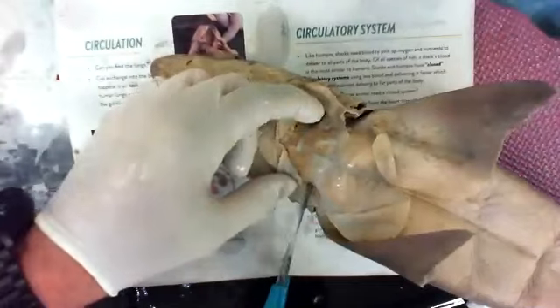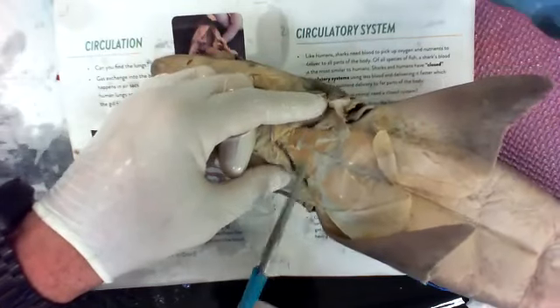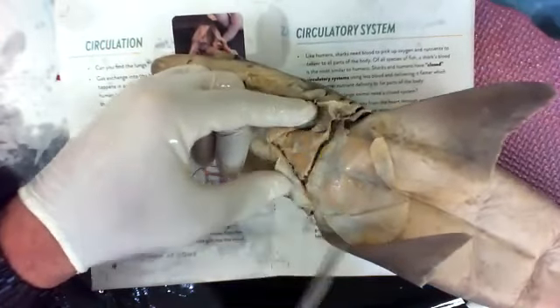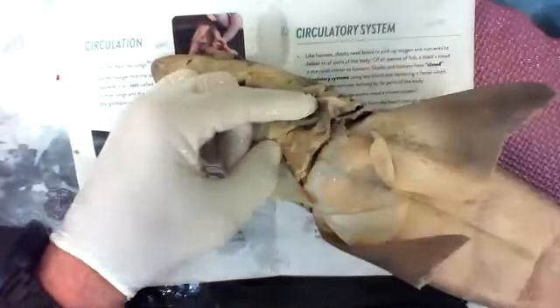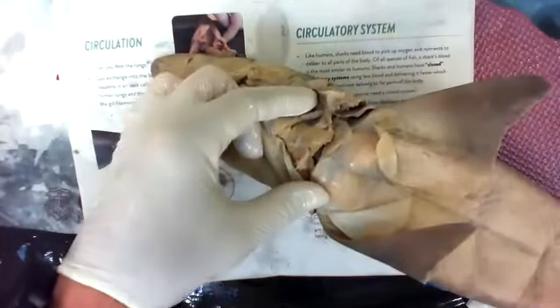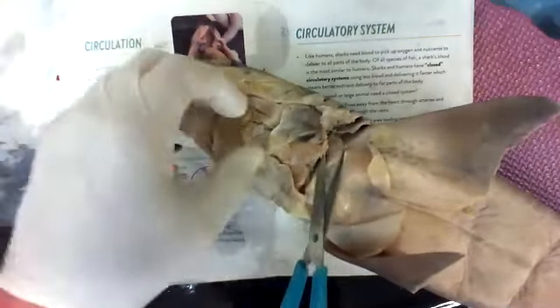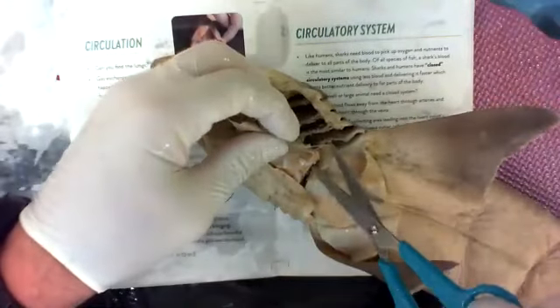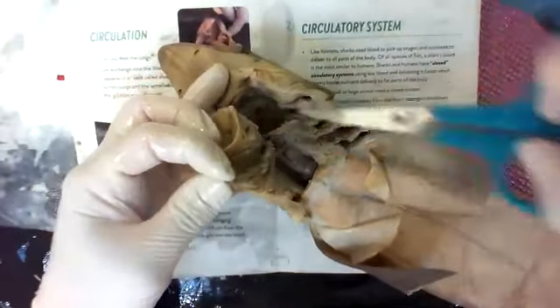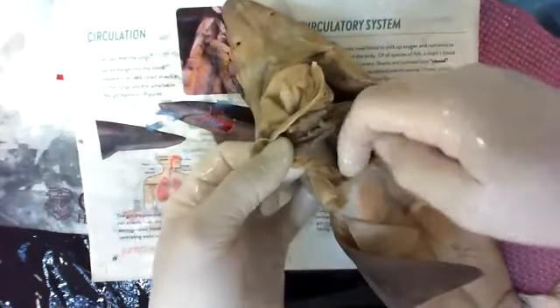We want to actually cut that sternum in half. Because of the way I dissected, I can push into this side and snip. I'm right-handed, so it just made it handy. See that? Cutting right across. I felt the snap of the breastbone, sternum. I use a lot of the layperson names, but I also will tell you the technical names. And I can already see my heart. There it is, right? So I'm going to keep going back here and finish this cut that I started before so I can open this up like a book. Right, I'm over here, snip. Just going to cut, cut, cut. Yeah, very nice. And there's our heart.